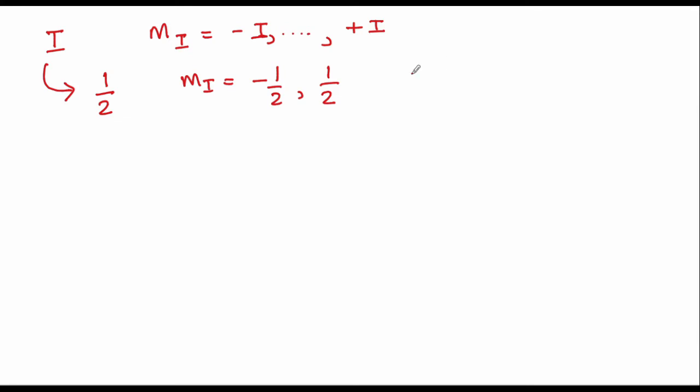So in this case, you are going to have two energy states that are going to be degenerate in the absence of any fields that are applied. But the moment you apply a magnetic field, what ends up happening is that these two states that were previously degenerate end up splitting from one another.